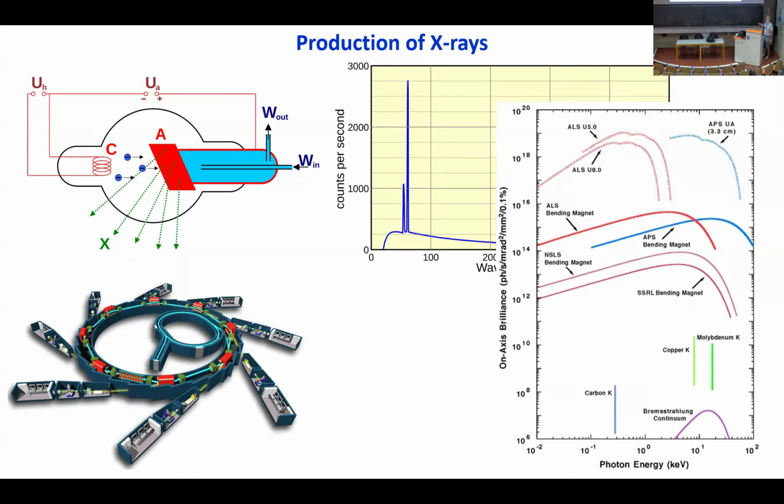You may be able to use a wide beam or at least a pink beam for some specific characterization, but most of the time, you will select one wavelength, depending on the monochromators available on the specific beamline you want to use.